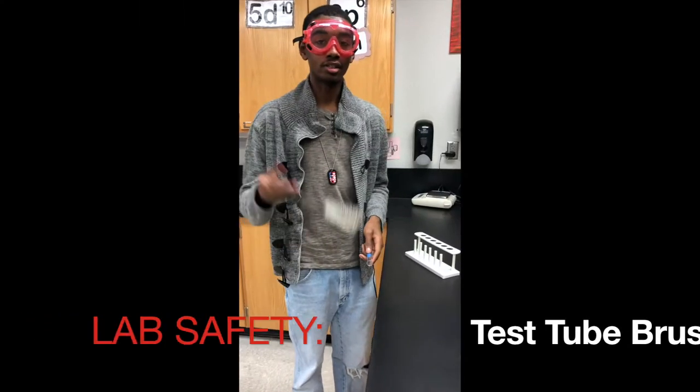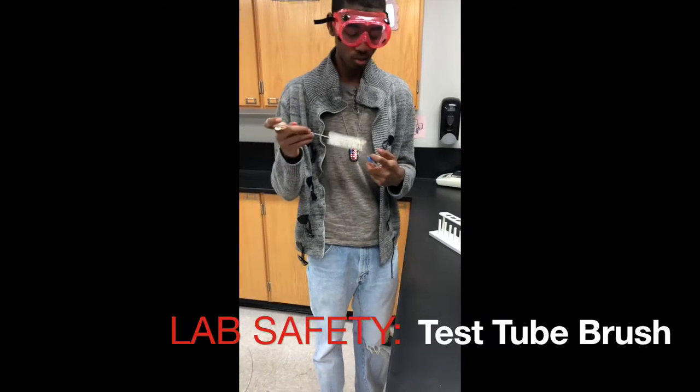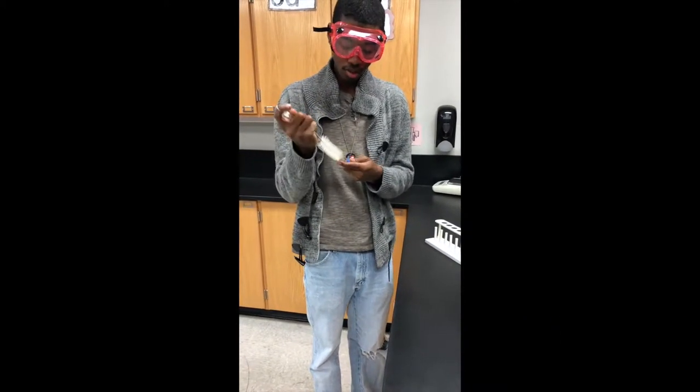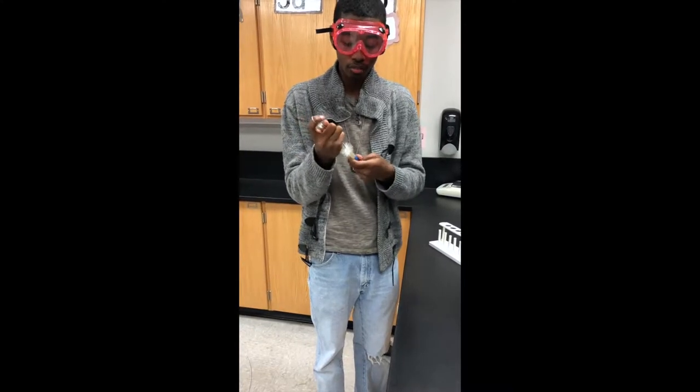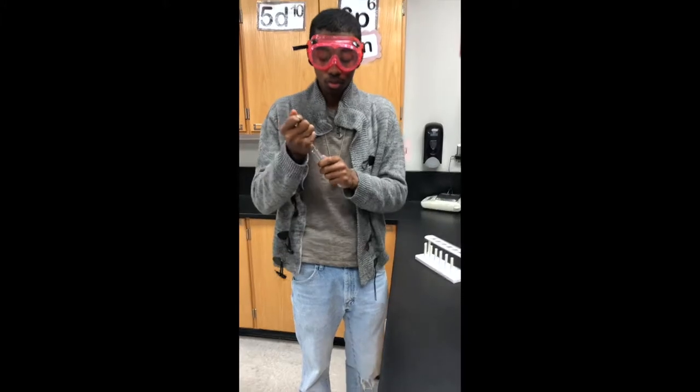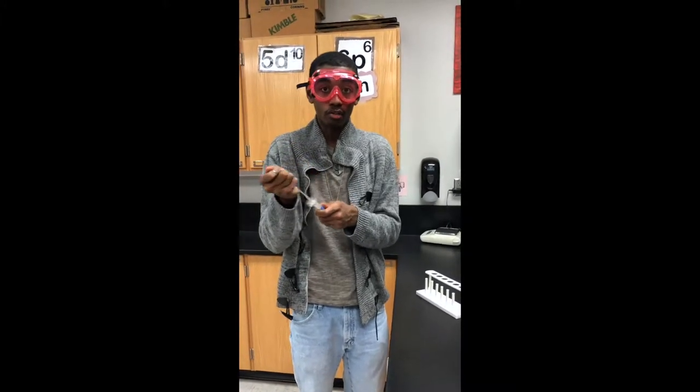Well, hello guys, this is a test tube brush. Mainly used to clean the test tubes, like so, and you basically have to put the test tube in here after you put some liquid in there. And it's basically used to clean the test tube so you wouldn't have to test chemicals.